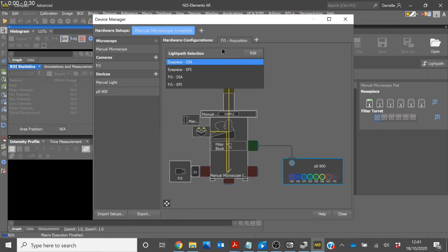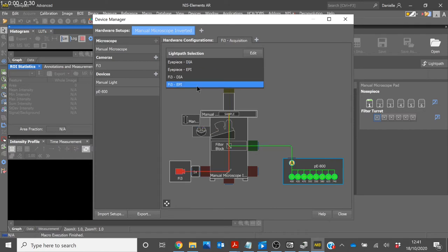We will then set the light path selection to Episcopic Fi3, which is the simulation camera that we are using. For this setup, we are using a manual microscope, so we do not have to worry about any automation of the filter turret. We can then click Close.